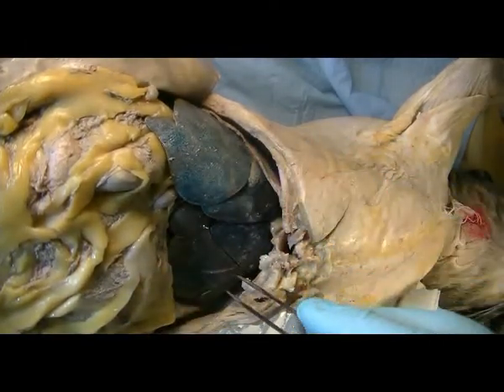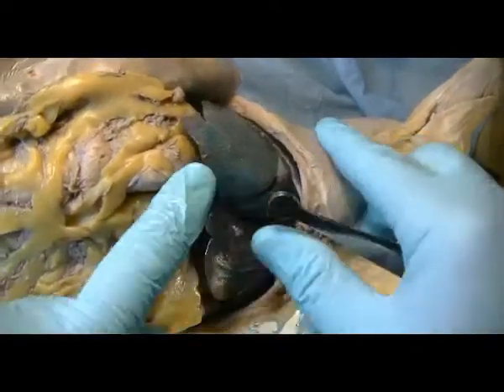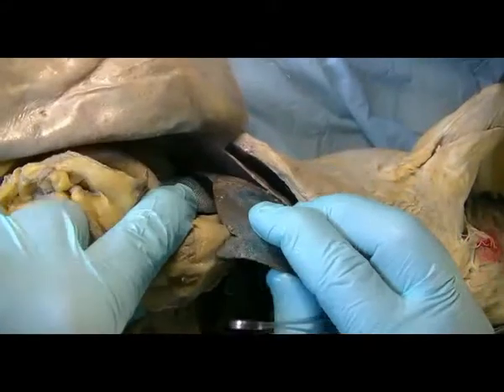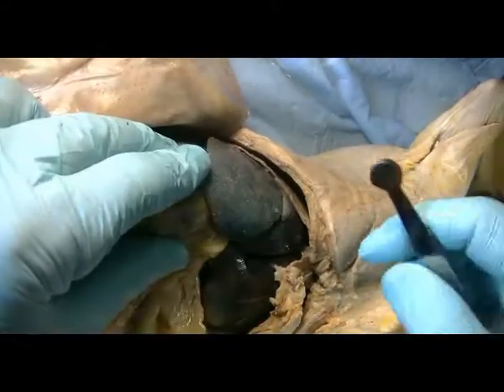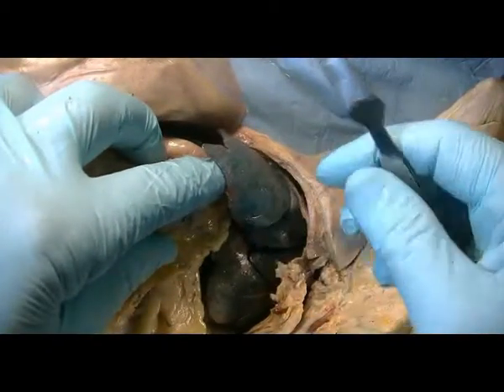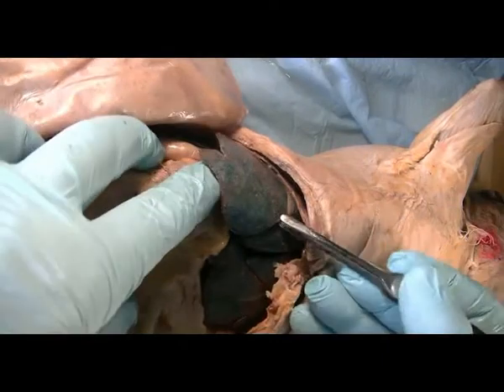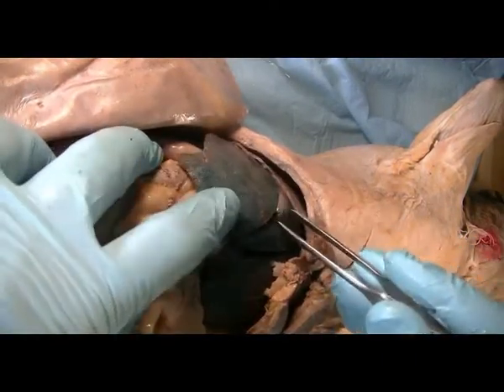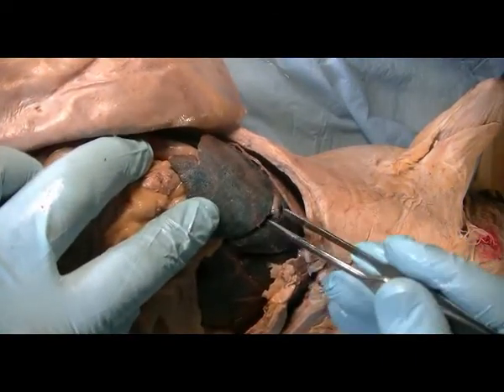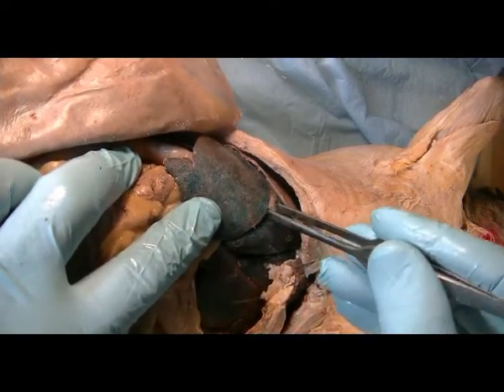Like I said before, this is the right side, and this is the left side of the liver. You have the right medial lobe. This is a fold where you can see the gallbladder.